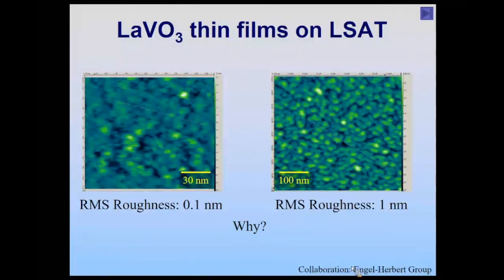different in the two. In an STM, the topography is a measure of a contour of constant integrated density of states. So it's a measurement of what the electrons are doing in the material. It's not really a measurement of the actual topography of the surface, if you were looking at, I don't know, how do you define on the atomic scale what that even means, but you're looking at the electrons when you're looking at an STM image.